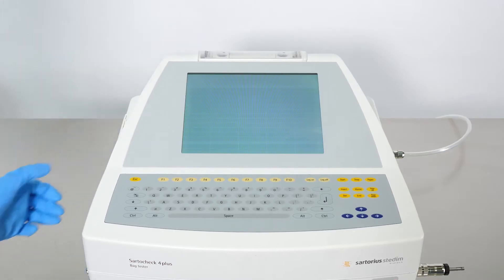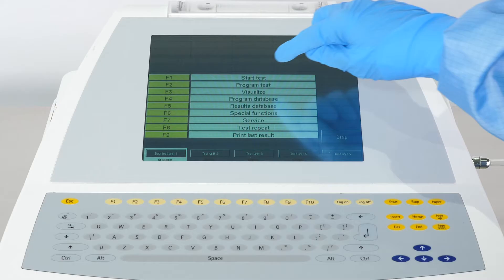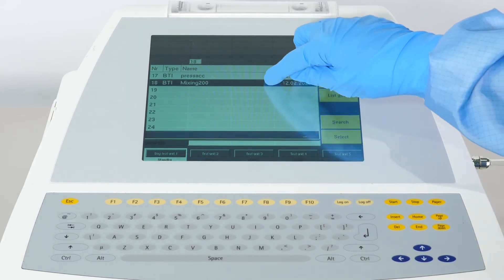Switch on the device and enter your credentials. From the main menu, press Start Test. Select the right program according to the mixing bag volume.